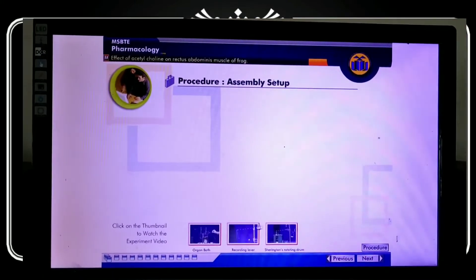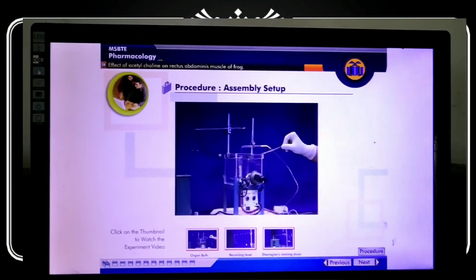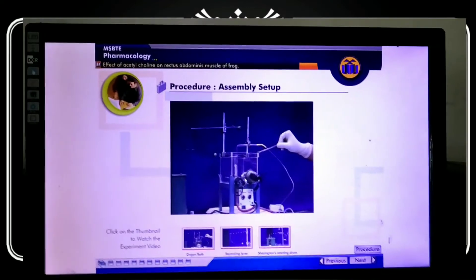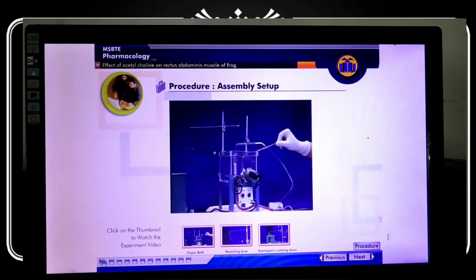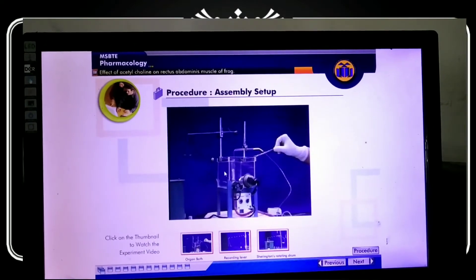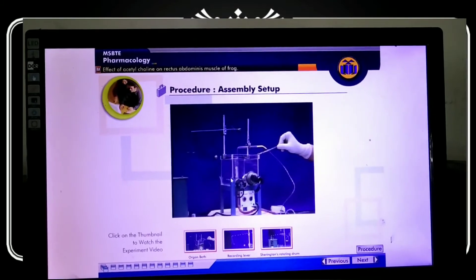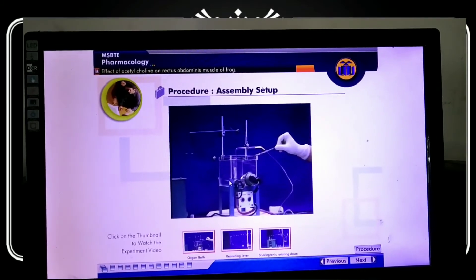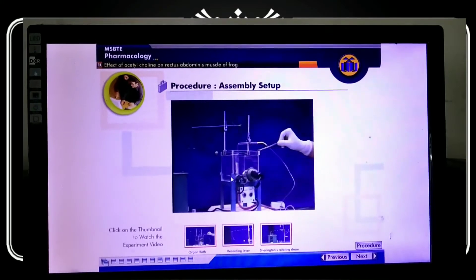Here we can see the assembly. This is the organ bath. In this organ bath we must maintain temperature. We will maintain the temperature using water. This is the setup used for the experiment.